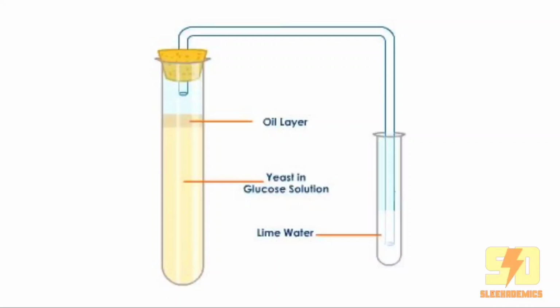This is to ensure that the oil covers and forms a layer at the topmost side, preventing oxygen from actually dissolving into the solution.